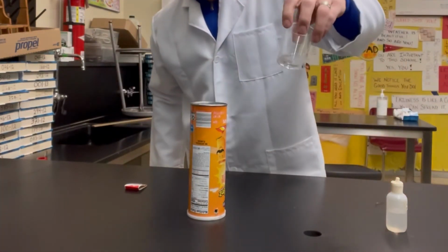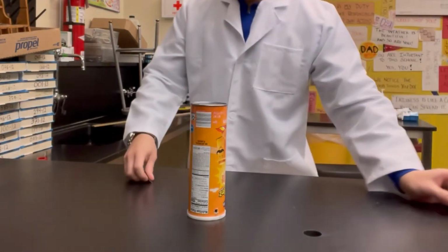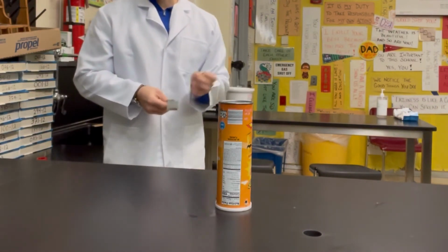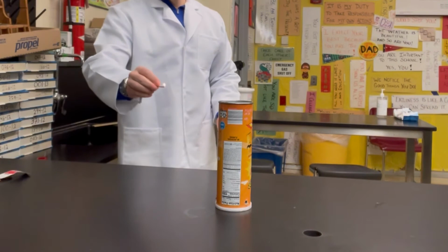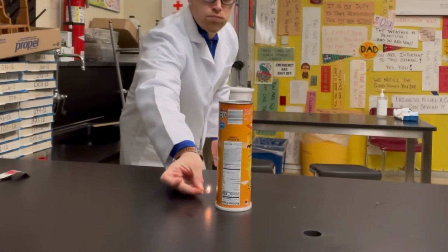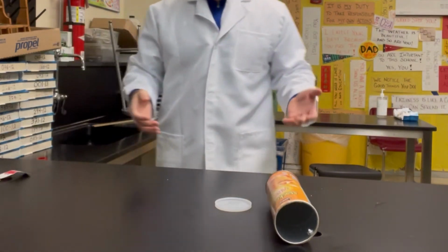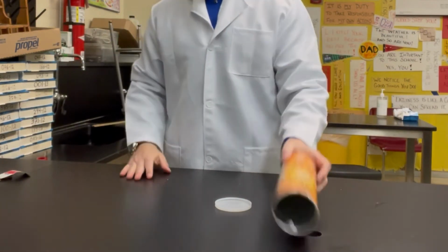This reaction is still going on. The zinc is reacting with the hydrochloric acid. But now what I'm going to do is test it out and light a match to see if hydrogen gas is actually there. So let's see. Whoa! Okay, there you have it. That was definitely hydrogen gas inside of that chip can.